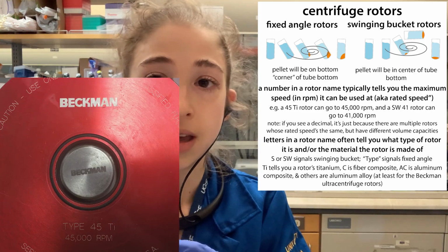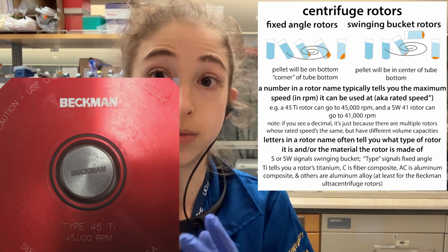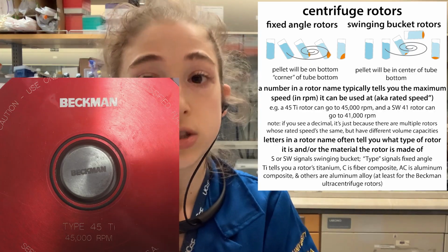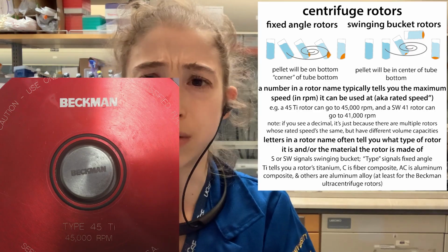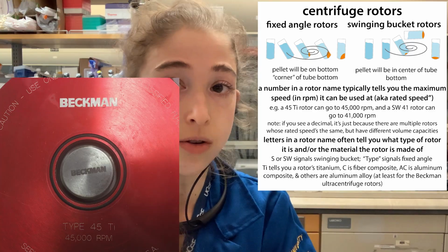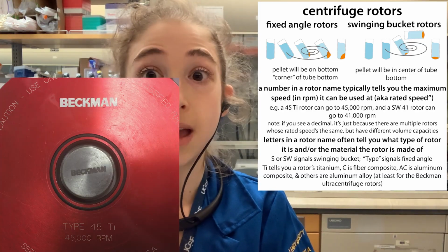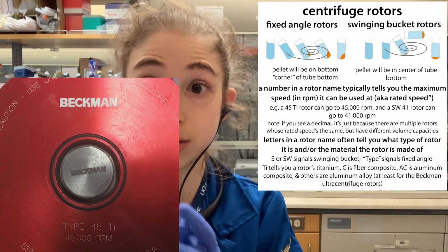if they say type, that is going to be a fixed angle. If they say something with an S or an SW, that's going to be a swinging bucket. And then there's going to be a number. That number is typically telling you about how fast it can go. So for example, a type TI 45 or 45 Ti, I can never remember which way they actually say it, but basically type tells you it's a fixed angle. The 45 is telling you that it can go up to 45,000 RPM. And then the Ti, that's for titanium, which is their strongest metal that they use to make these.